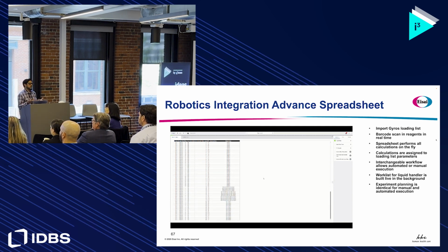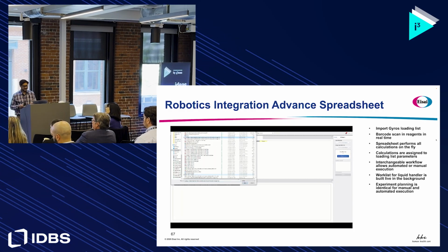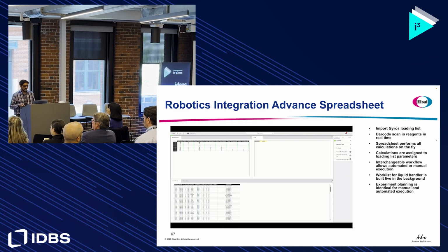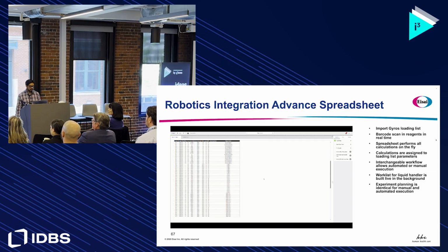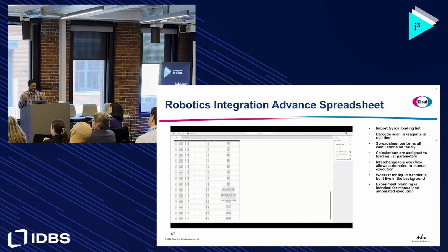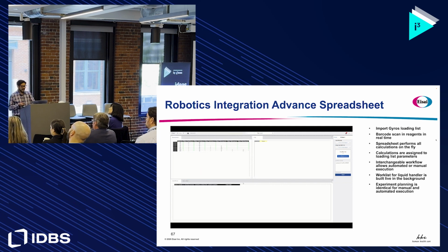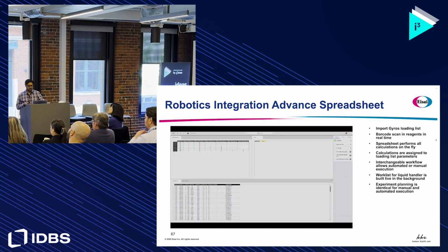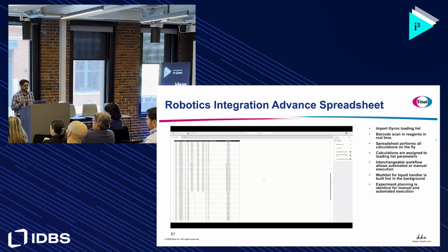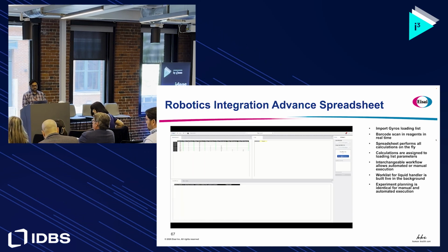So now we have to do all that front-end work for the gyros, right? We got to make our stocks, got to make the standards, we got to do all these things. But we have inventory on our side to help us through this. So inventory, since all of our reagents are in inventory, all it is a barcode scan away. We can go in, we can scan in our material IDs right in there, pull up the information, then the spreadsheet does all the calculations for us. We don't have to do anything. Even we can make working stocks that are just used for that assay. It's in the lower section there. And it'll do all the calculations for you on that. It'll do unit conversions, all those great stuff. And you can choose the buffer and assign it the buffer so it knows, so we can build the associations.